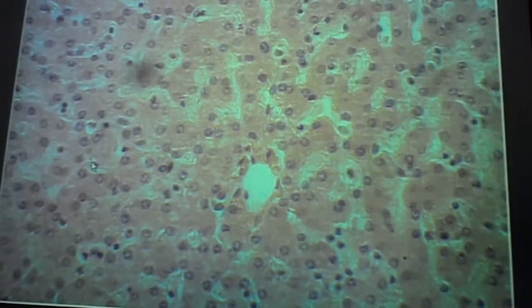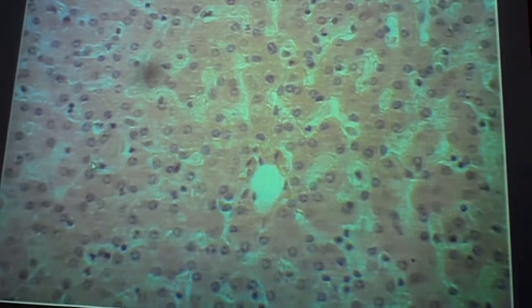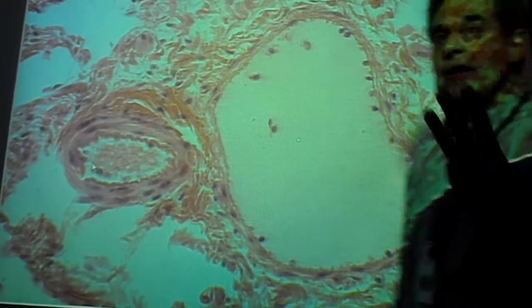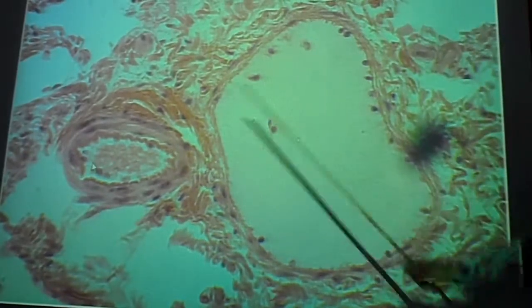Where does the blood come from? Well, glad you asked. There are two blood vessels that carry blood into the hepatic sinusoids. They're part of what is called a portal triad. Tri means three, so there are three vessels, two are blood vessels, and here they are.